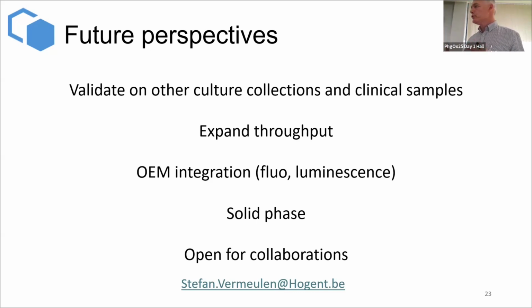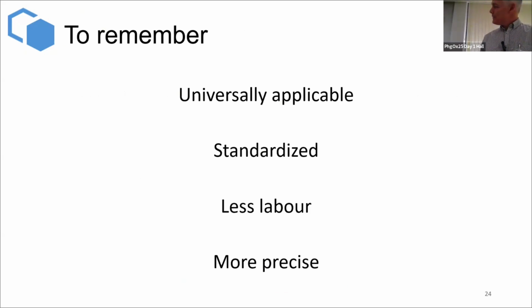One of the comments was also that you work in fluidic conditions. We are nearly there to do it in solid phase, and we are open for collaboration. So to remember, it's a universally applicable method. It's standardized in contrast to the double agar overlay method. It's less laborious and it's more precise. Thank you for your attention.